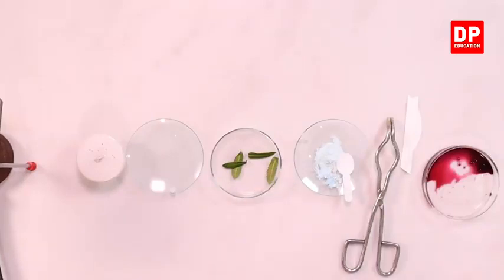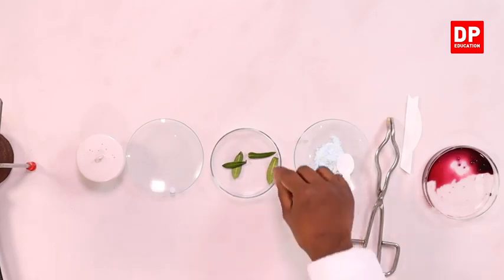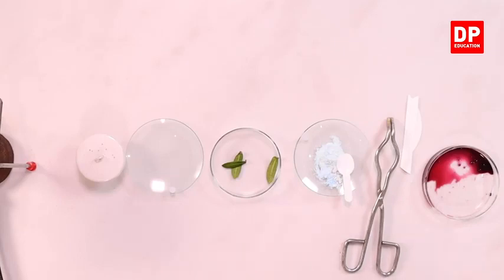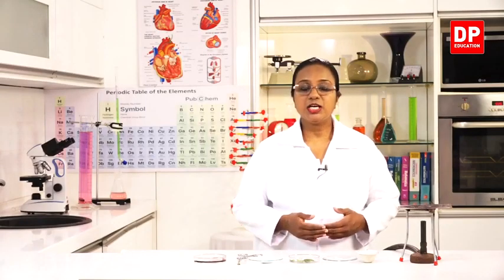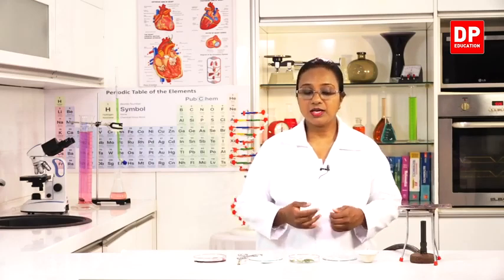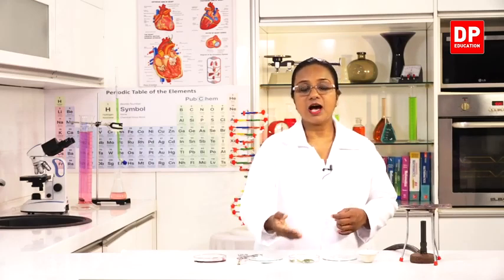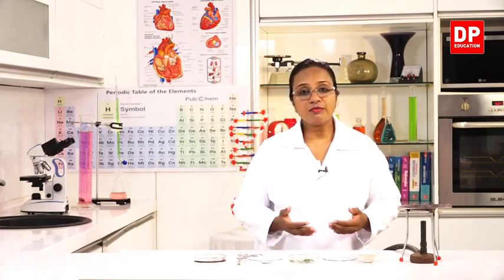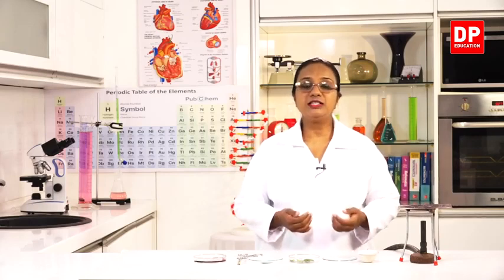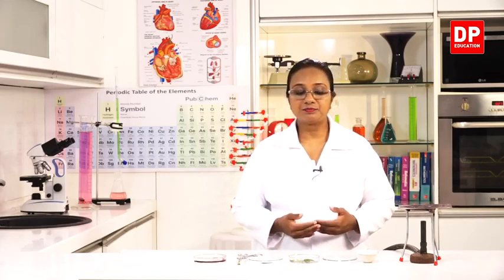We should make sure that if the sample is a leaf, we don't wash it prior to the activity. If we wash it, we wouldn't know whether the vapor that is coming out is from the water on the surface or from the sample. So, we will have to make sure that we use a dry sample.